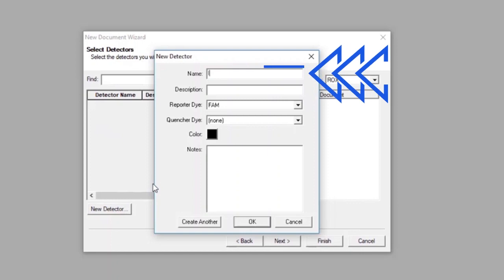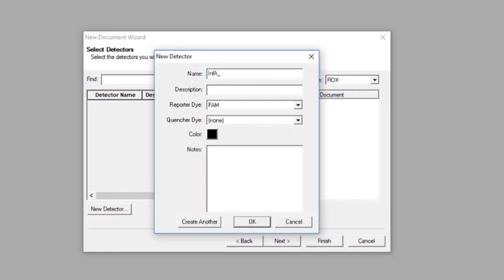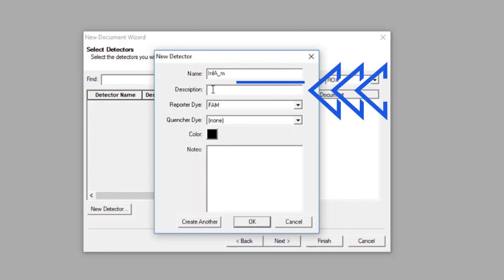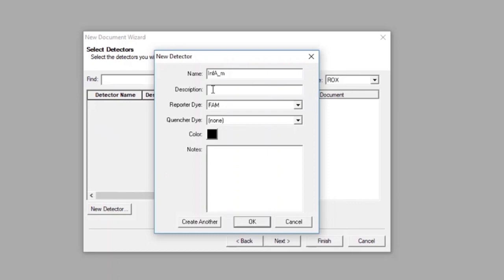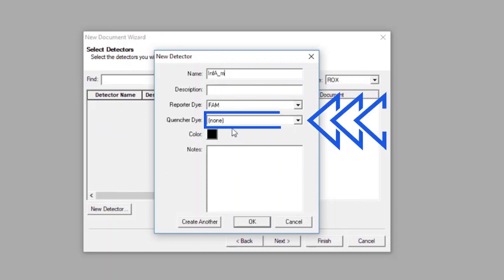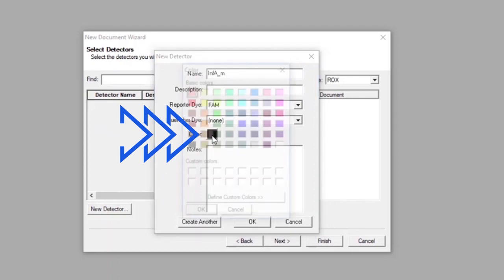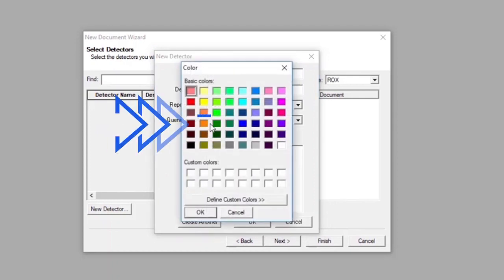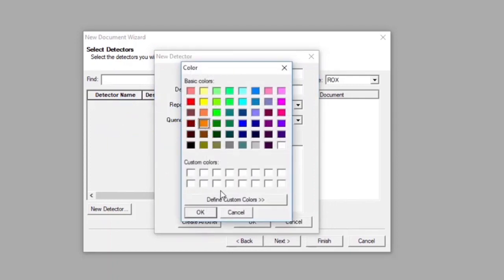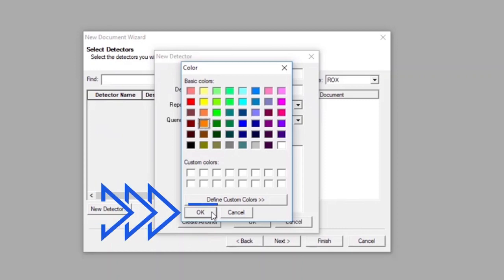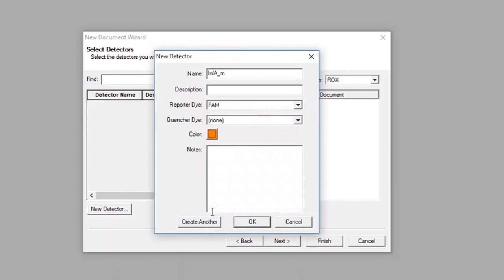In the New Detector window, type INF_A into the Name box. Leave the Description box blank. Set the Reporter dye to FAM, but leave the Quencher dye set to None. To select the color of the detector indicator, click on the color square to reveal the color chart. Select orange as the color for the INF_A detector, and click OK to return to the New Detector screen.